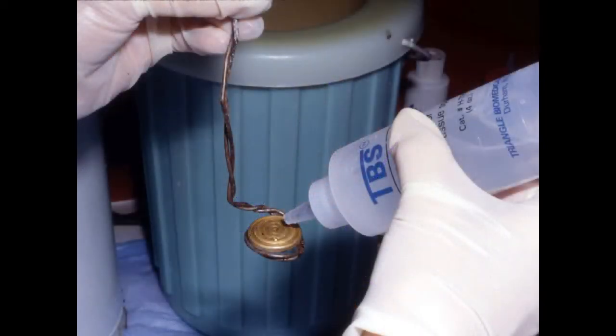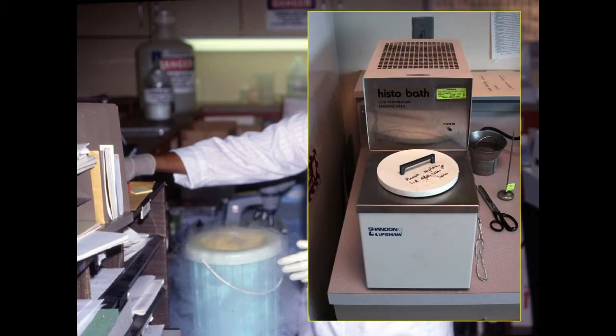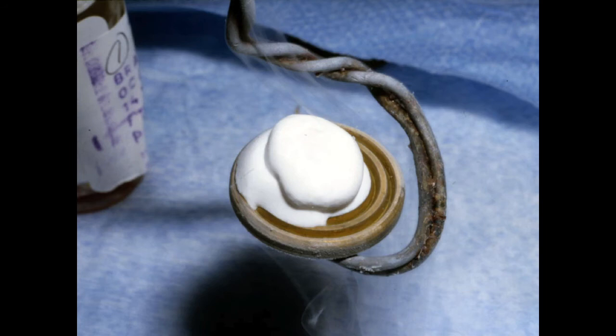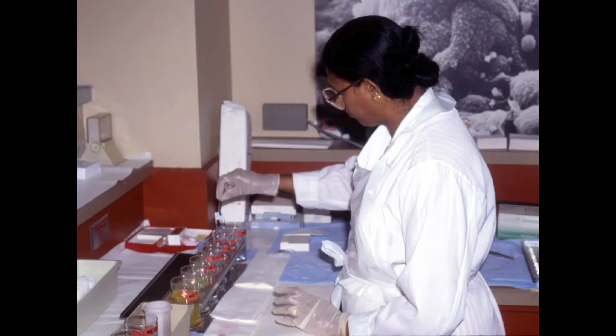During frozen section diagnosis, a metal stub is covered with tissue embedding medium. The fresh tissue is placed on the stub and covered with more medium. The tissue is flash frozen using liquid nitrogen or refrigerated isopentane. This shows a specimen after it's been frozen. The specimen is sectioned in a refrigerated microtome called a cryostat. The sections are then stained rapidly with H&E.